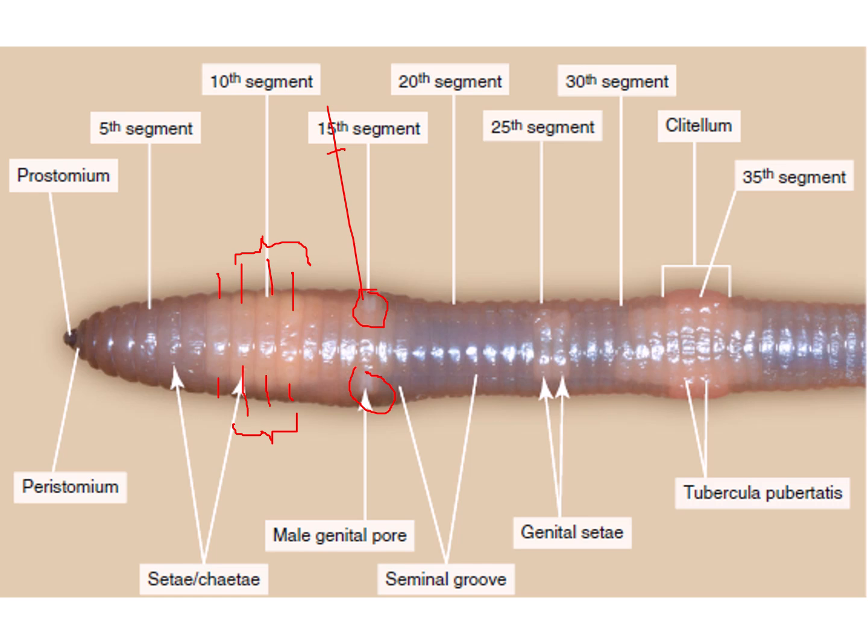These pores are not very visible. Sperms from another individual during copulation are stored in these spermatheca, and later they come out on the outer side of the body wall, and then reach the oviducts, or the female genital opening. On segment number 14 in this species are the female genital pores. There are 2 female genital pores where the oviducts release eggs, but they are not visible like the male genital pore, which is very visible. Female genital pores are inconspicuous.